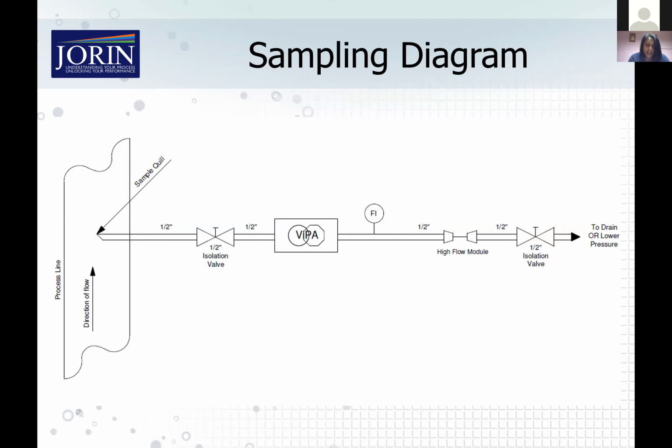So in terms of connecting online, really, it's very, very simple. We run a sort of bypass system, so we don't actually necessarily go inline. So it's online as opposed to inline is how we refer to it. In a perfect world, we would like to connect to a sample point that has vertical upflow on your process site. So that just basically gives the most representative sample data. All your solids are running through that vertical section of pipe.